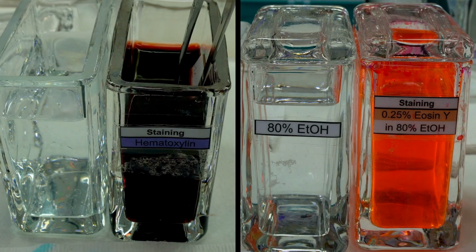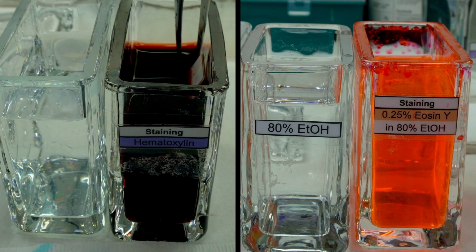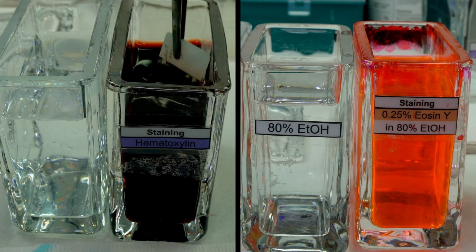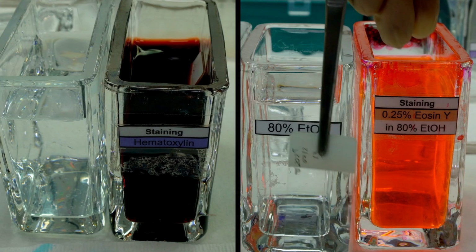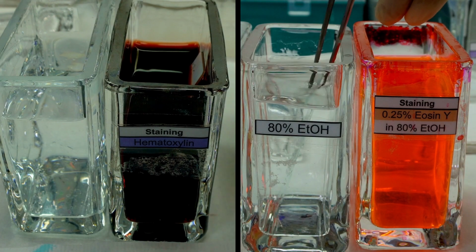And then comes the absolute classic, the workhorse stain in nearly all histology labs, hematoxylin and eosin. Often just called HE staining or H and E stain. Yep, H and E stain, that's what everyone calls it. You don't usually say the full names. Okay, H and E stain it is. What does that combination reveal?